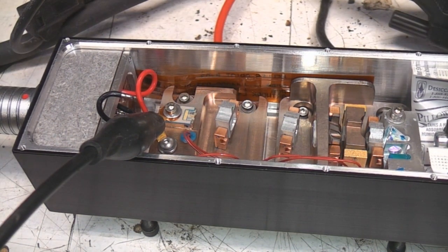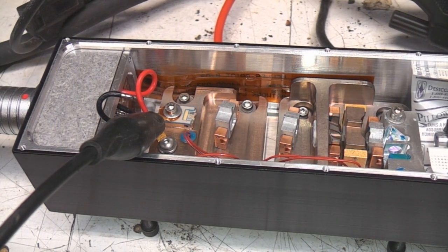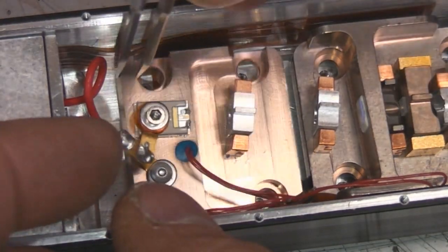Now we're possibly slightly less concerned about its health, I might pull the blocks out and have a look at what's on that rear flex. One other issue is, from what I can gather, the power supply units and the heads are like matched pairs, in that they calibrate them all as a matched unit, so it wouldn't surprise me if there's also an E squared on that backboard with a serial number or something on it, so I think we need to take a look at that.